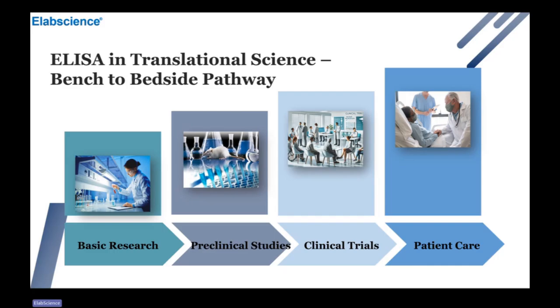As we know, ELISA plays a key role in translational science, bridging laboratory discoveries to clinical applications. Starting with basic research, ELISA identifies protein targets and pathways. In preclinical models, it monitors biomarkers and validates therapeutic candidates. And finally, clinical studies rely on ELISA for monitoring and diagnostic evaluation.